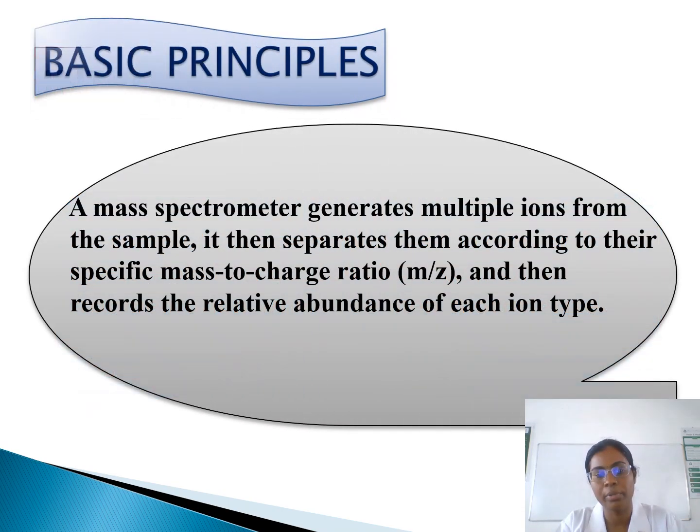So what are the principles involved in mass spectroscopy? Mass spectroscopy is a high technique used to identify the molecular weight or molecular mass of a particular unknown compound, for example proteins, alkanes, and flavonoids, whatever it is. So it is the big molecular mass, correct? This big molecule leads to smaller molecules to find the molecular weight of the particular compound.